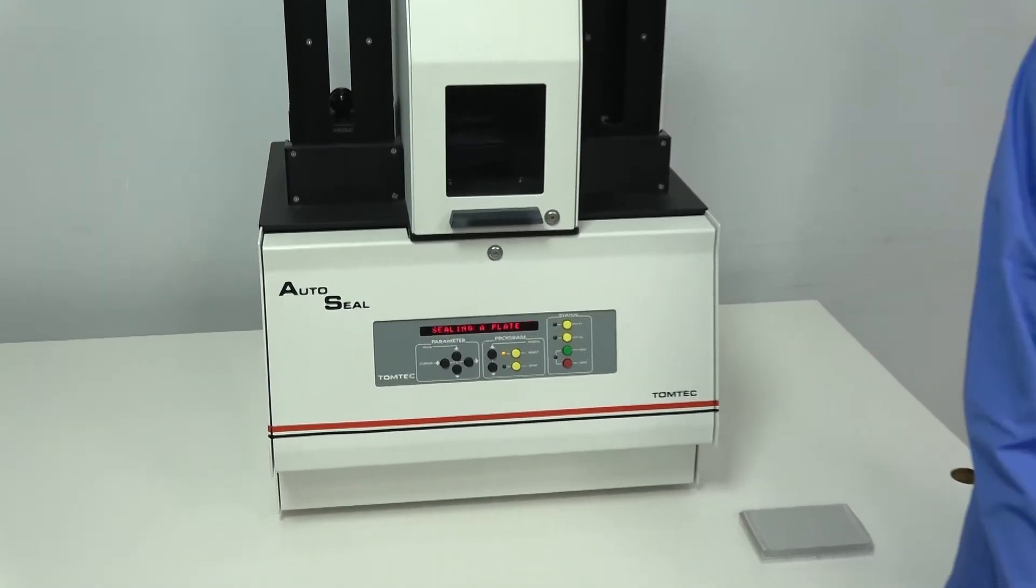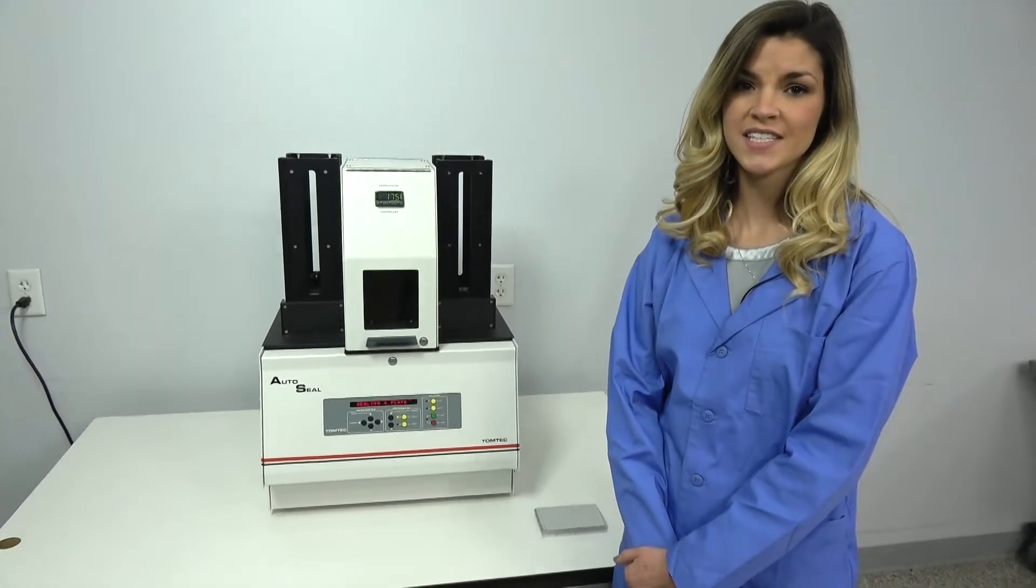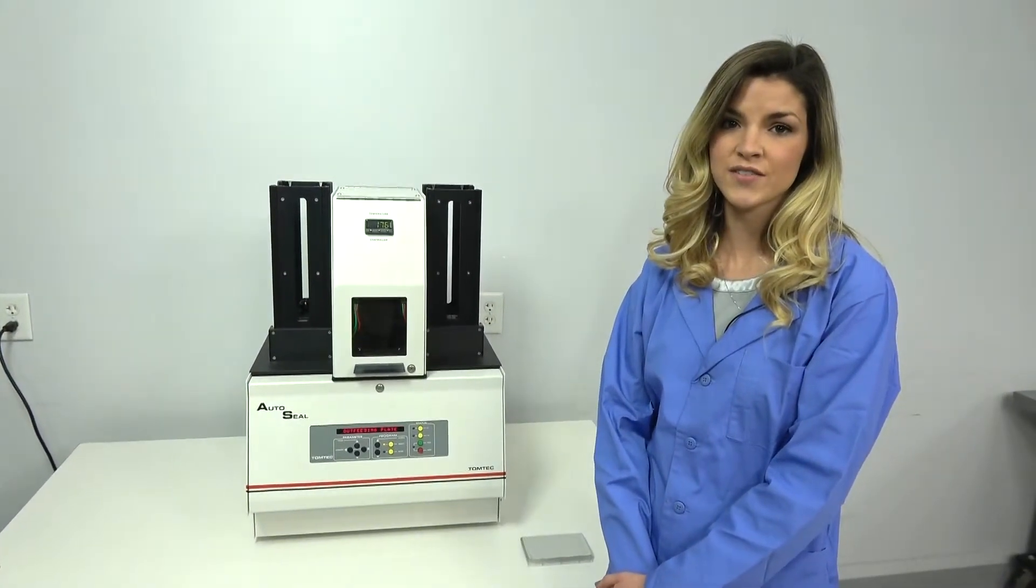This unit is fully functional. It has been inspected by our technicians, is operational, and is located here at our Cridersville facility.